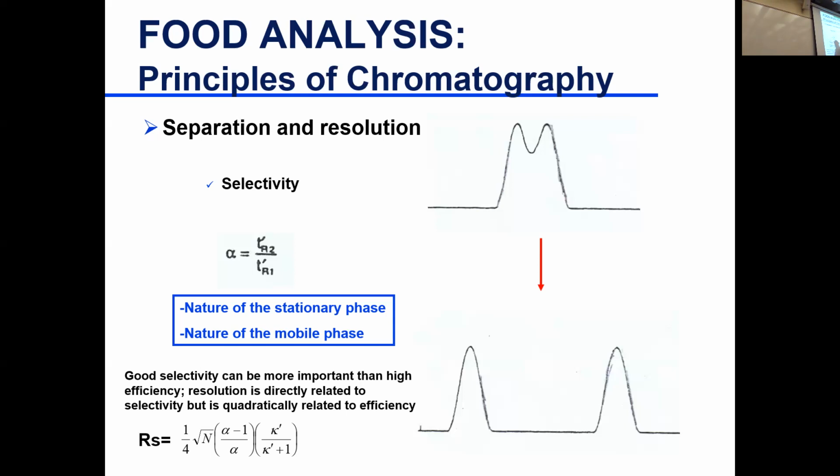One of them is going to be slightly more polar than the other and will be delayed, and the other one would appreciate a little bit of methanol and come out. Then you get separation. So you enhance the selectivity of your separation by changing the nature of the mobile phase completely. You can also change the nature of the stationary phase.